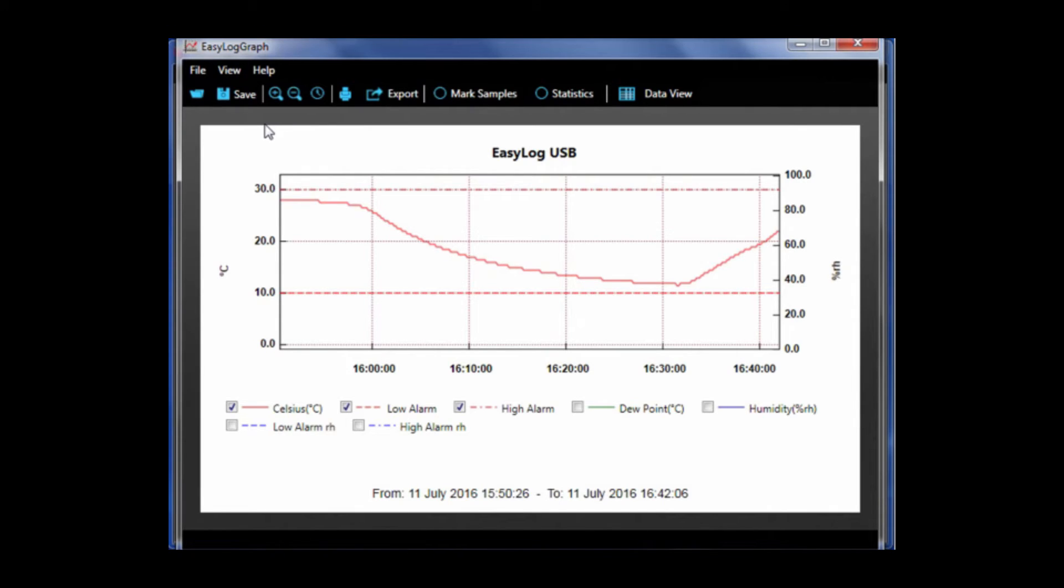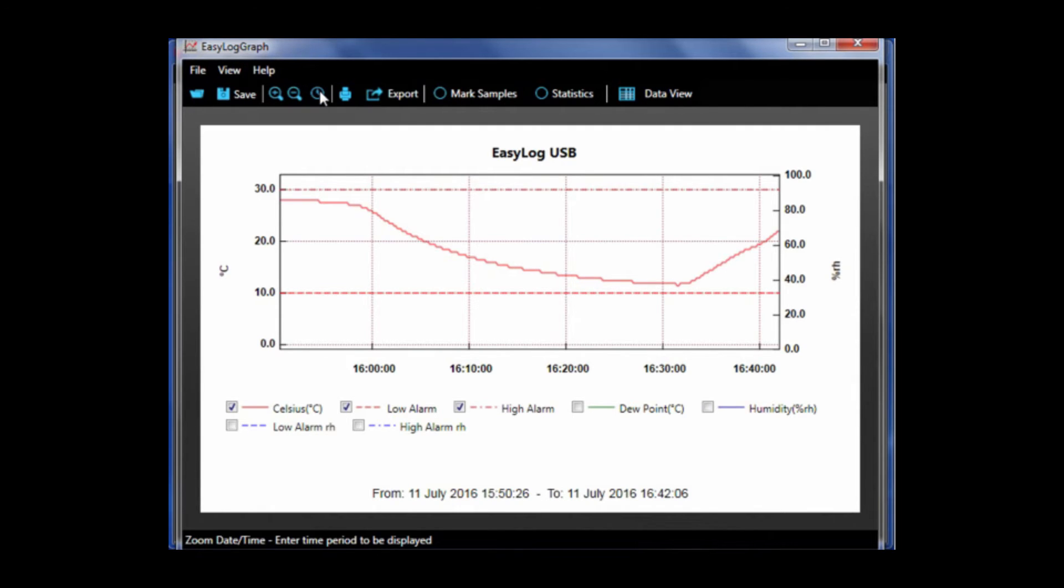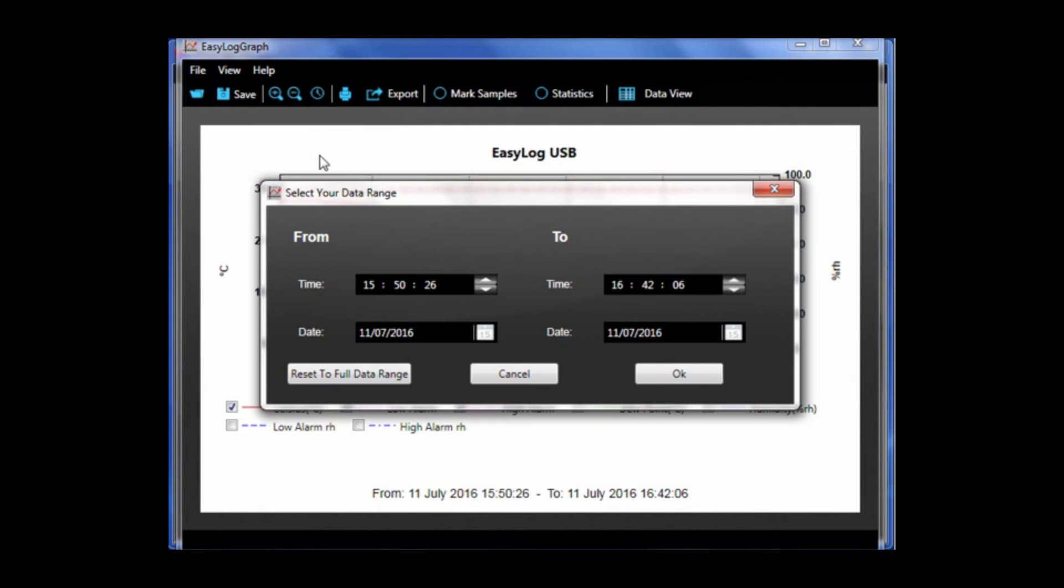To the right of that is a magnifying glass with the plus and minus which allows you to zoom in and out of a selected area on the graph. Also there is a clock image which allows you to enter a specific date and time period to be displayed.